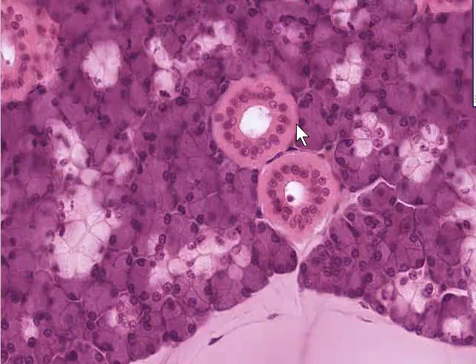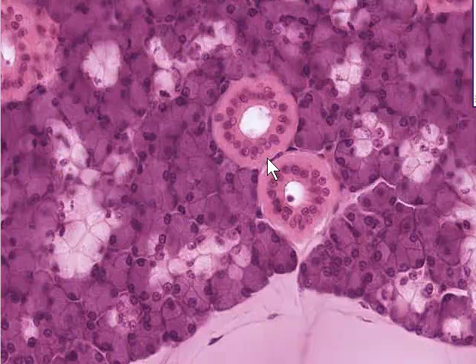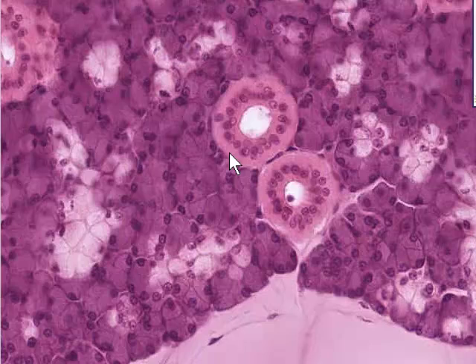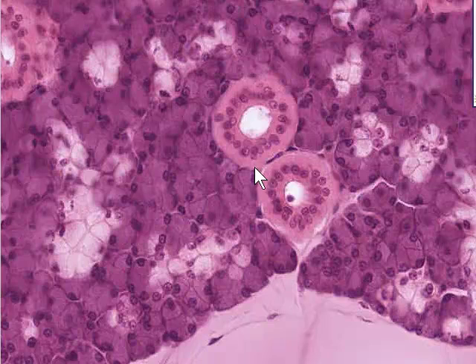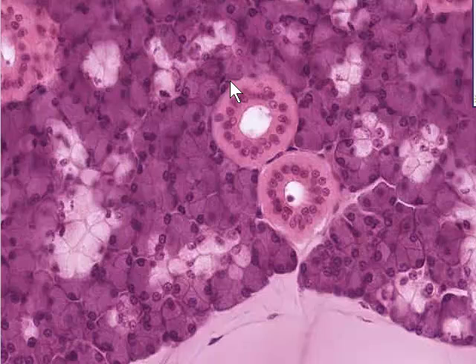One thing to note about both the parotid and the submandibular gland is that some of these ducts form part of a system called striated ducts. The basal aspect of these cells appears somewhat stripy, because they have many mitochondria lined up in basal infoldings of the cell membrane. This is a characteristic of ion-transporting or ion-secreting cells, because striated ducts are responsible for modulating the ionic concentration of the saliva being secreted.